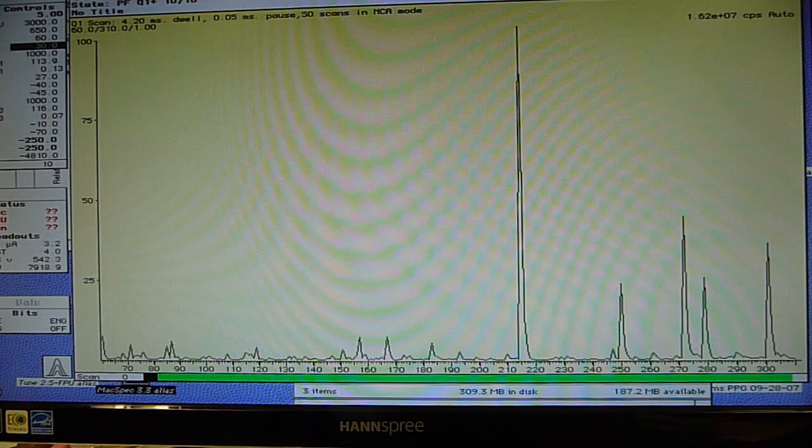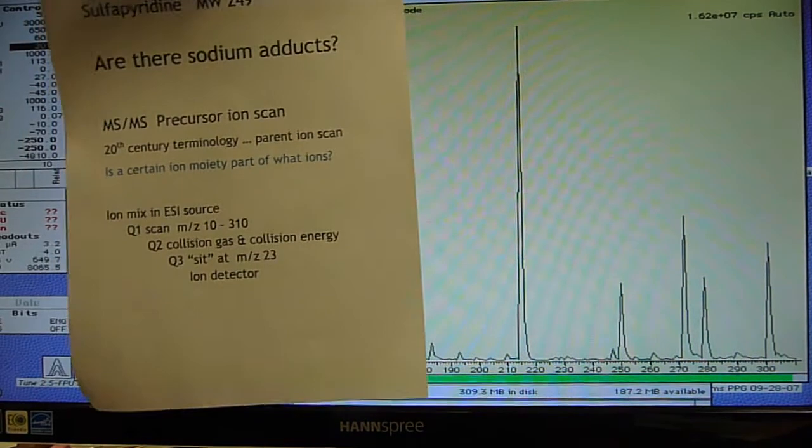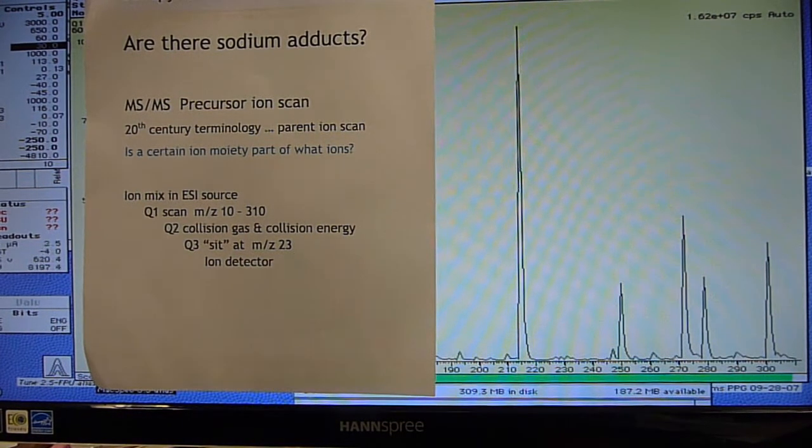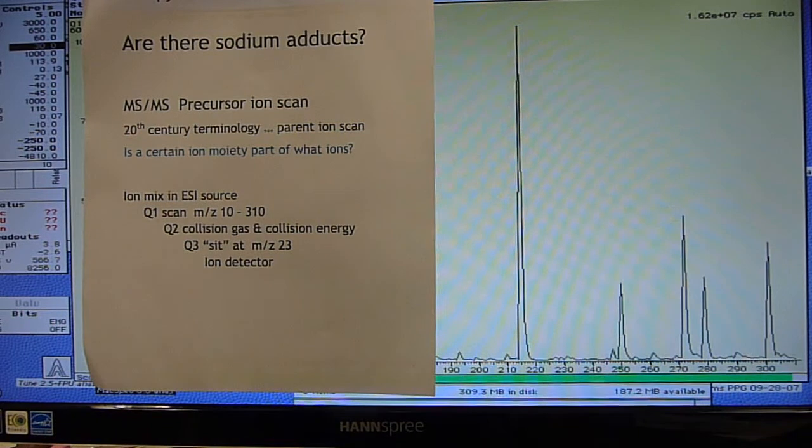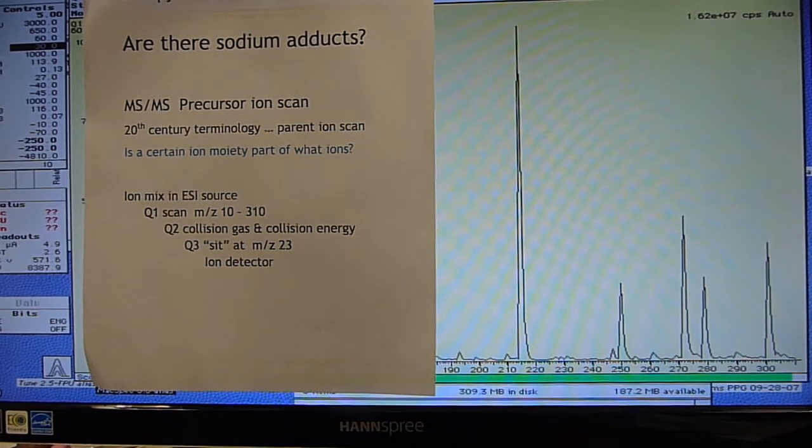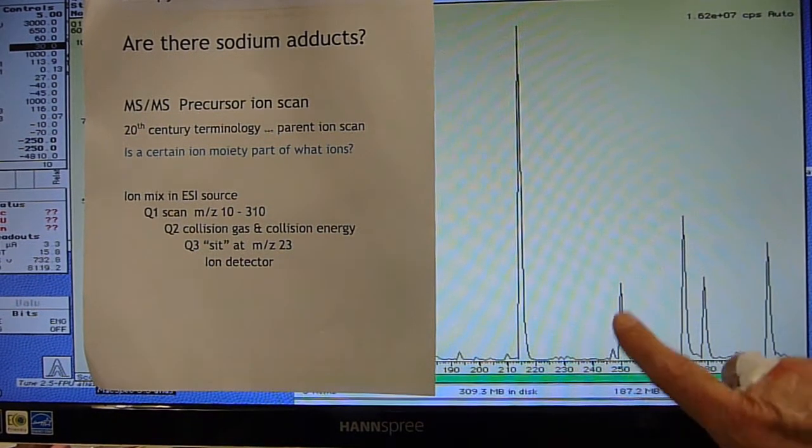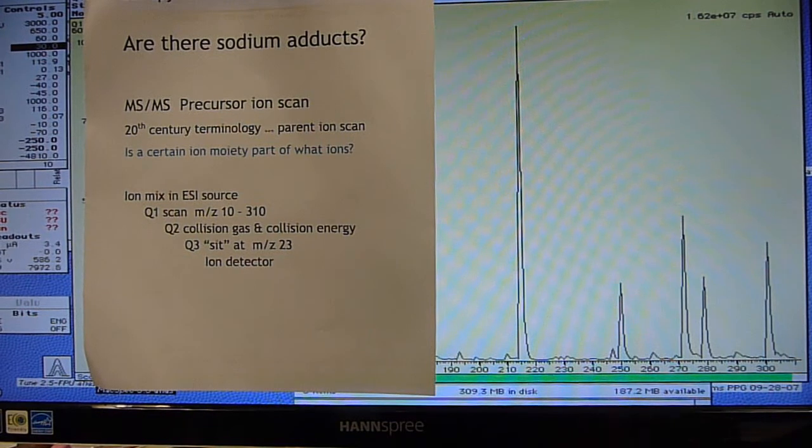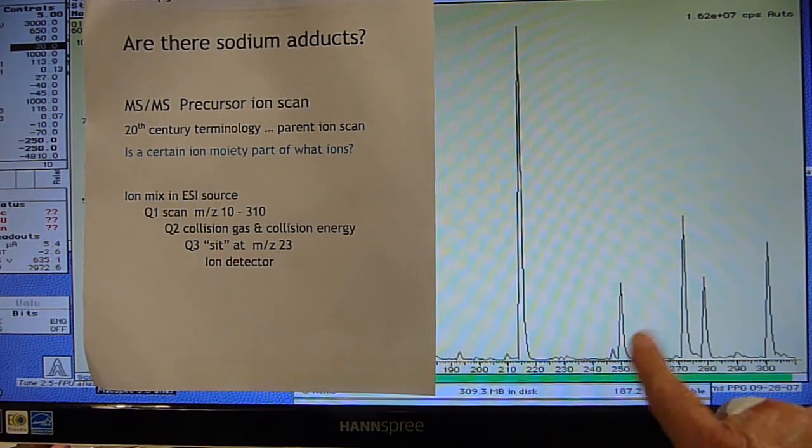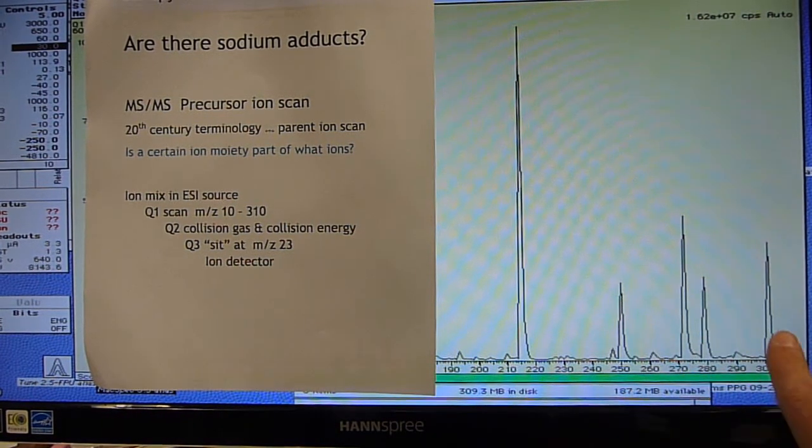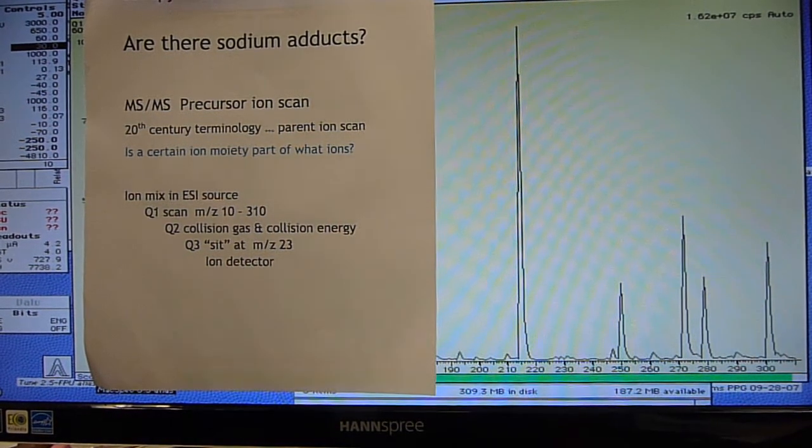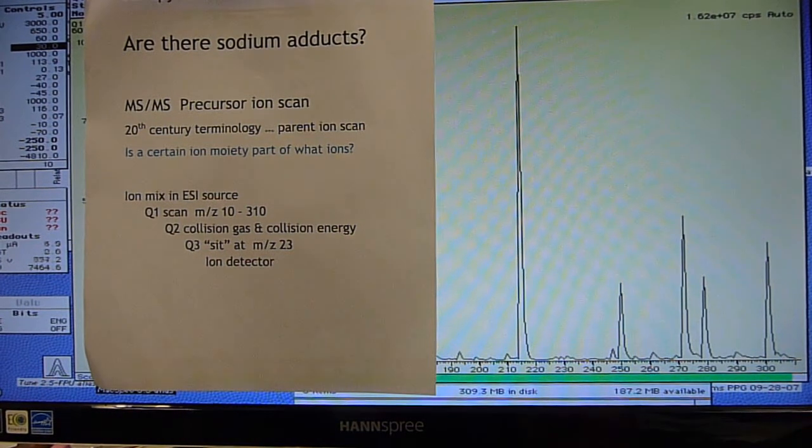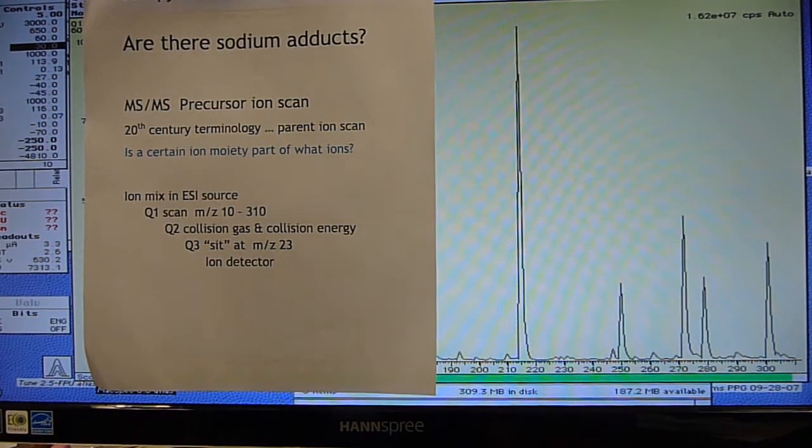For this video we're going to take a look at a precursor ion scan. We're going to ask the question, are there sodium adducts? Typically a sodium adduct if two ions are 22 apart from each other that's usually a good indication. This is the M plus one for sulfapyridine and then this is the M plus 23. So maybe this is a sodium adduct, but then also this is 22 higher. So maybe this is also a sodium adduct. And so what we're going to ask the question is, is there a certain ion moiety that's part of these ions? And that moiety is a sodium ion.